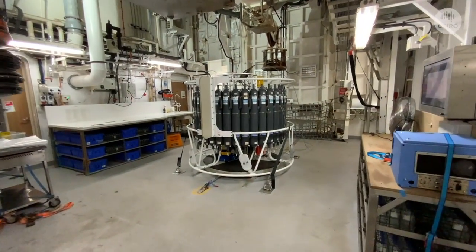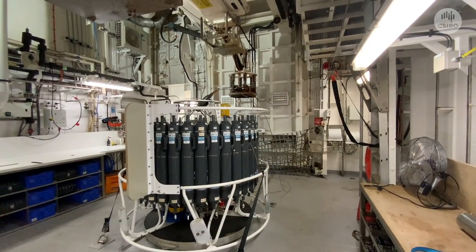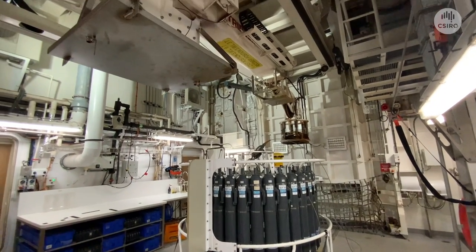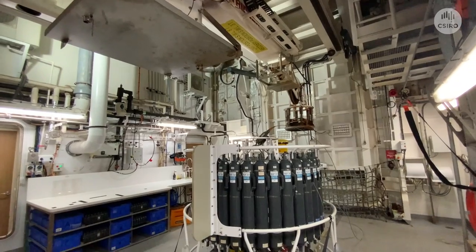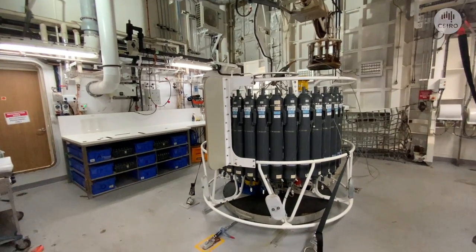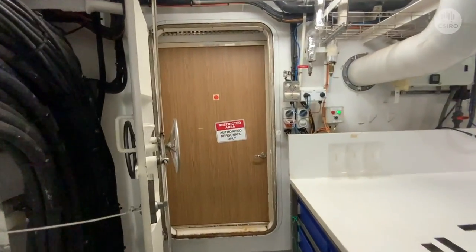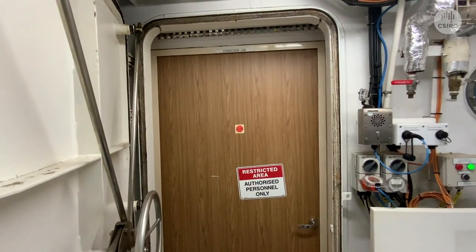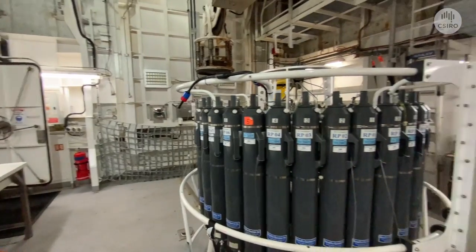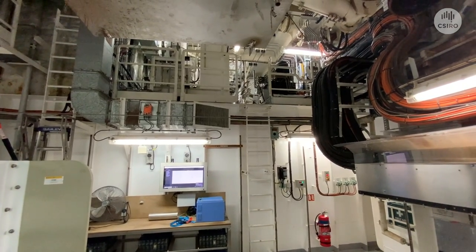CTD space with the sampler here. When we operate it, the door you can see at the other end is opened up. This CTD is lifted up and extended onto this boom, and the CTD is lowered into the water to the desired depth, and water samples are taken. Once it comes back on board, the sampling takes place here. And I was just talking to you from the hydrochem lab, and this is the other door from the hydrochem lab. Two winches for the CTD are up on this level, both 6,000 metres electro cable.